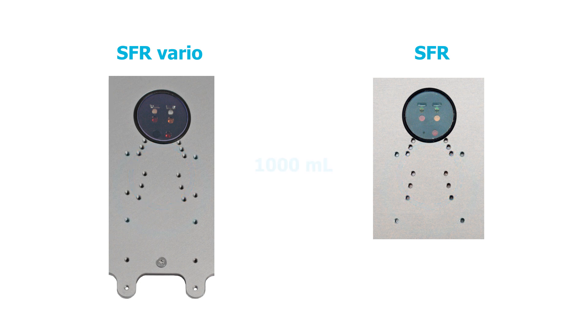Clamps for 1, 2, 3 or 5 liter flasks all have the same spacing between the screws, but you must choose a different position on the reader so the sensors inside the flask are positioned above the optics.